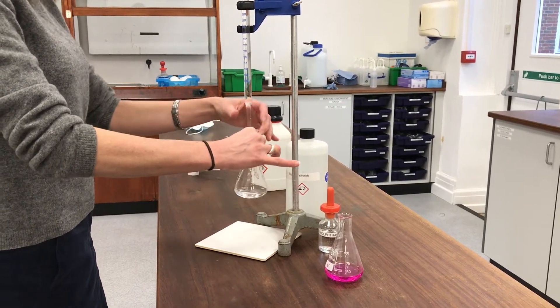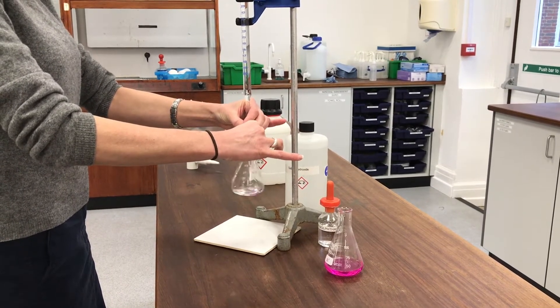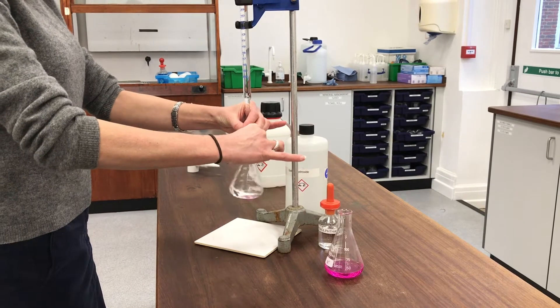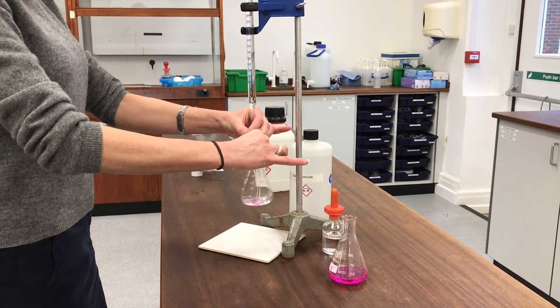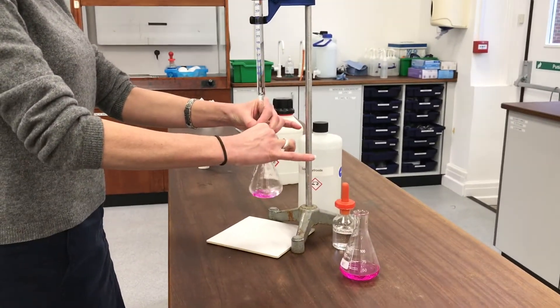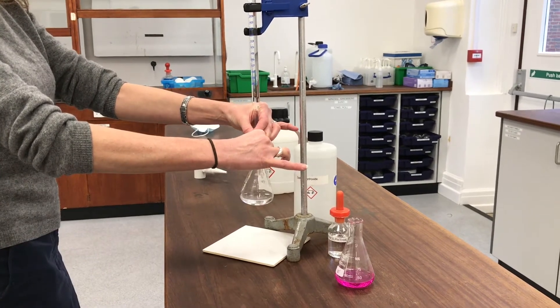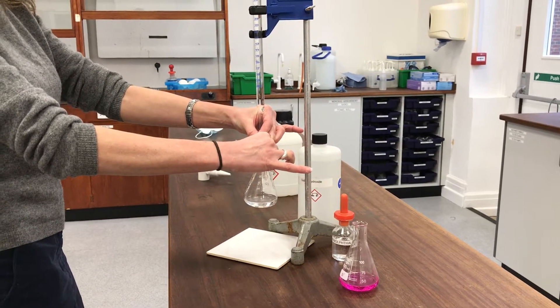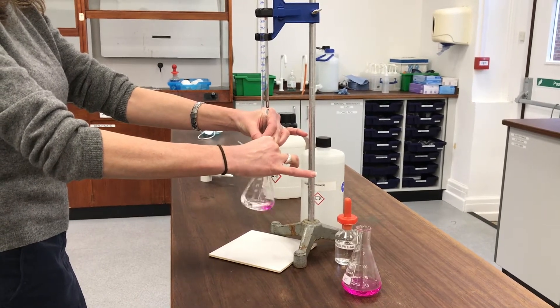I'm getting near the end point now. I'm within a few centimetres cubed of the end point so I'm slowing it right down - it's going in a steady stream of drops now rather than a constant stream of liquid. I'm going to slow it down even more so that I can add it a drop at a time and have time to swirl in between.